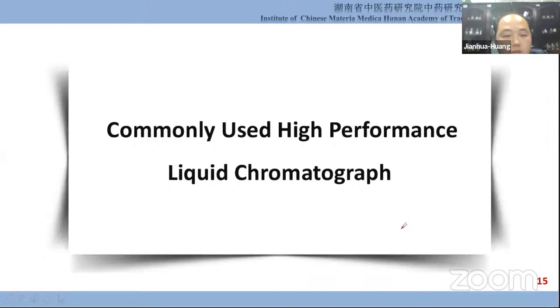Okay, next we will show you 2 commonly used high performance liquid chromatographs. I will show you the video about them.